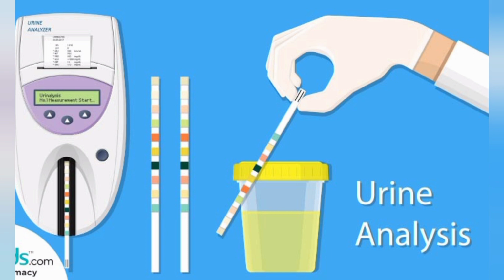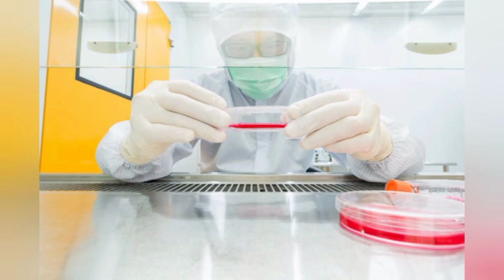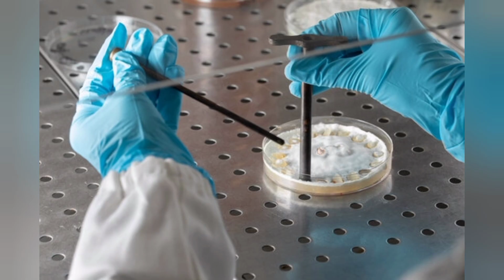Next equipment is laminar airflow. In labs, generally people work with sensitive cultures and samples that are very sensitive to things floating in the air. A small volume of air can have millions of particles and microbes in it. So, in order to keep the cultures or samples safe, work is required to be done in a sterile filtered air environment. That role is played by laminar airflow.